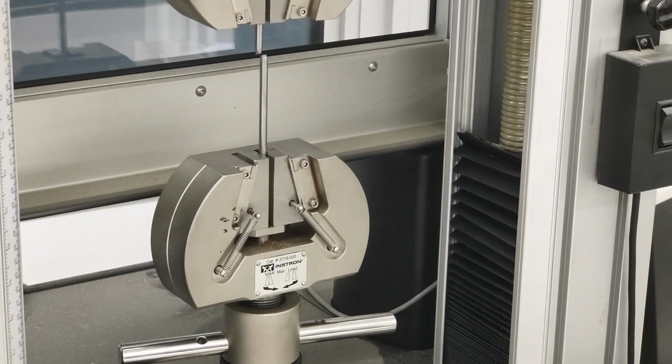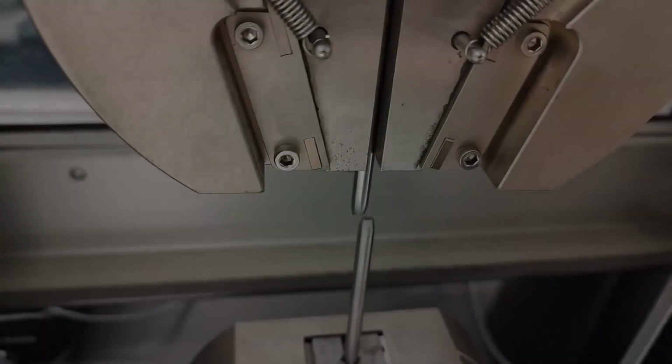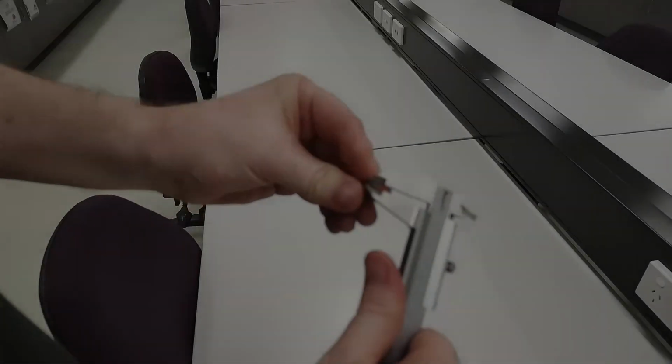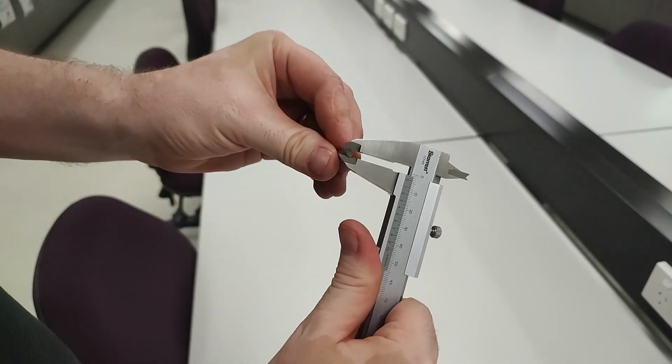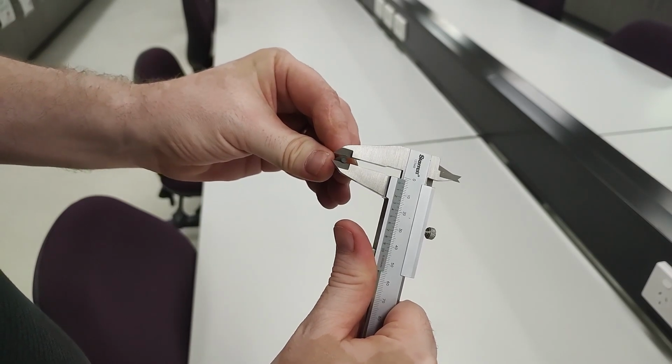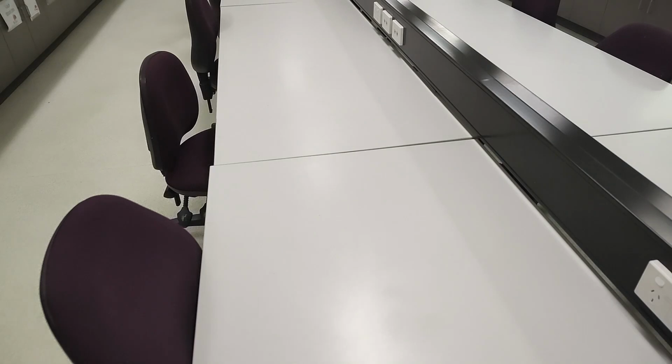You can clearly see the reduction in the cross-sectional area at the site where the fracture has occurred. The broken specimen will now be compared to the undamaged sample by measuring the diameter of the plastically deformed necked section. It measures at 4.2 millimeters. We can now calculate the reduction in cross-sectional area as a percentage.